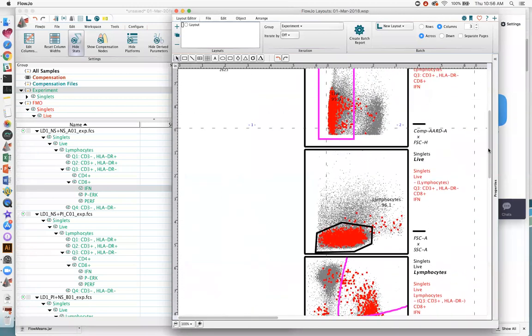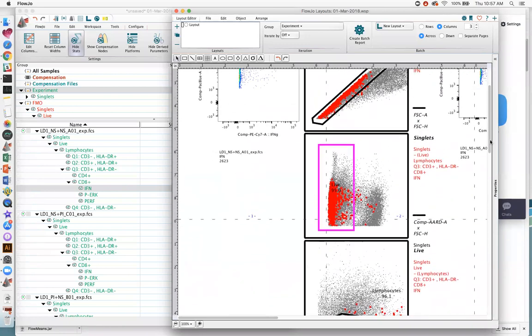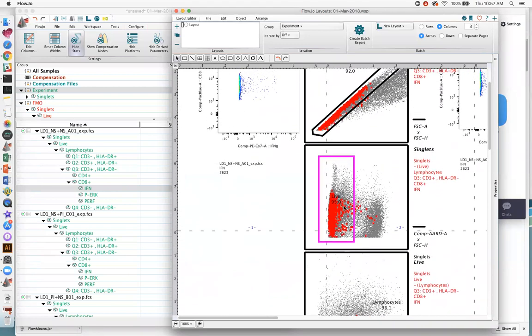Okay. Walk it back to some of the more quality control gates, you can see that I've captured the vast majority of my lymphocytes in that central region, and a lot of them spread the gamut of the forward scatter. So we have a decent gate placed on those guys. We're picking up maybe some monocytes or maybe some cells here that might be heading towards death.